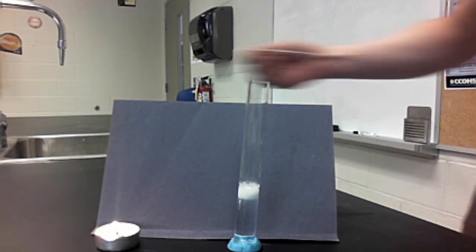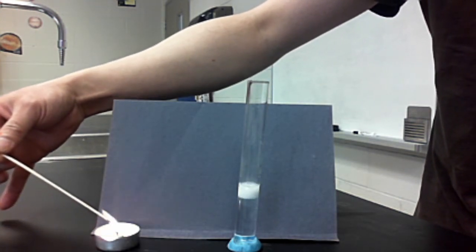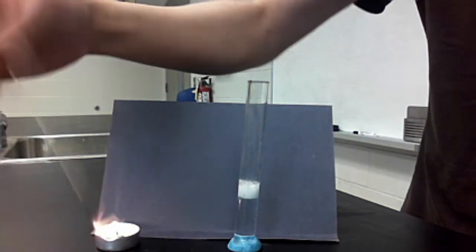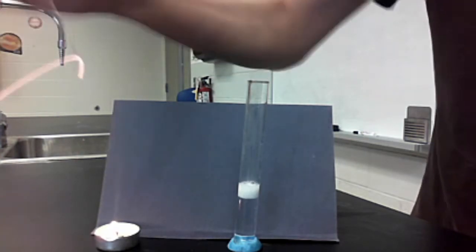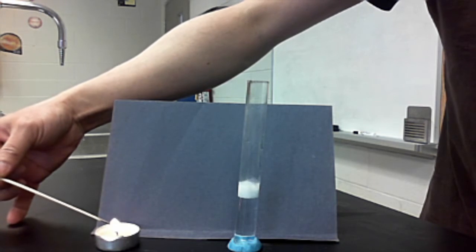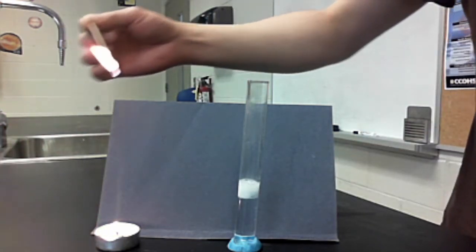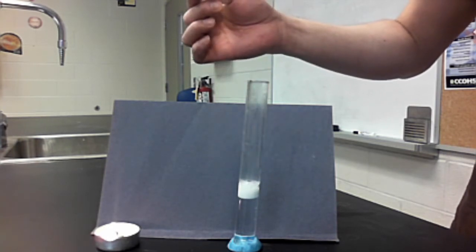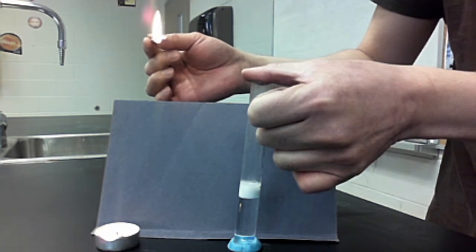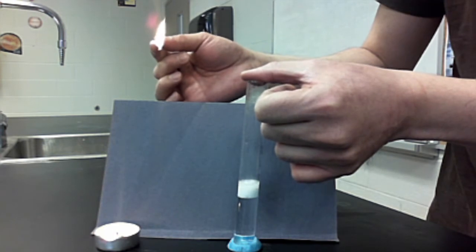We're going to place the mossy zinc inside the hydrochloric acid, and immediately a gas is formed. The question is: what is this gas being produced? If I use a glowing splint — just a splint that's only glowing, not part of the chemical reaction — nothing special happens with a glowing splint. So we know it is not oxygen being produced. But if I place a lit splint in, we hear a pop. I'll build up a bit more gas, count to ten, and test it again — and there's a pop being generated.